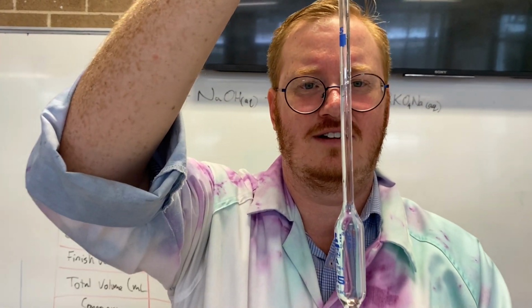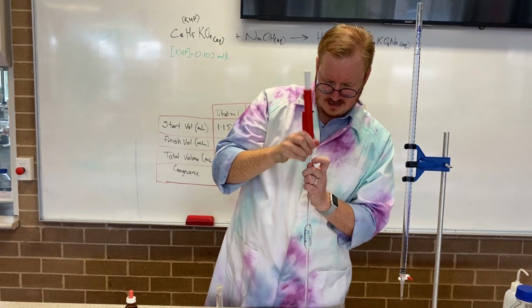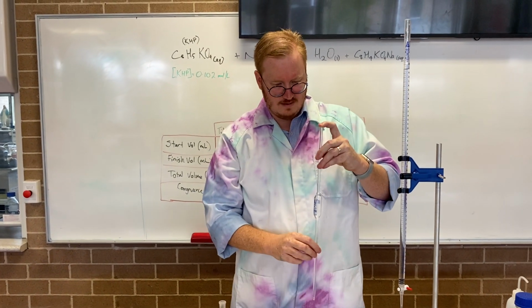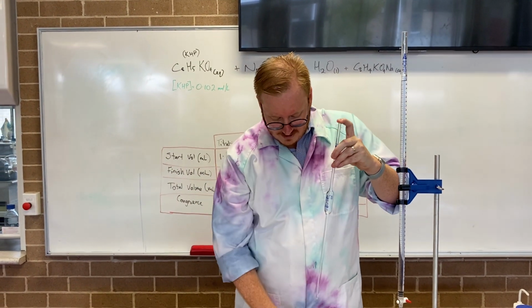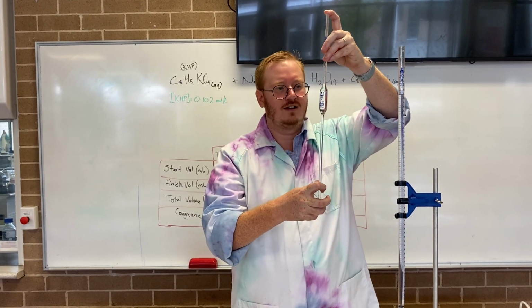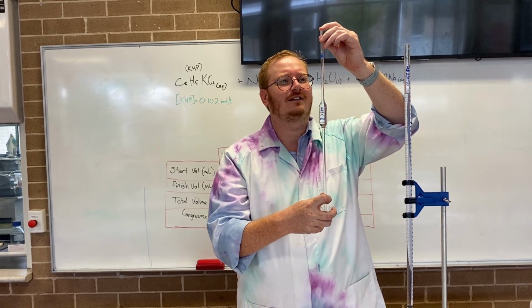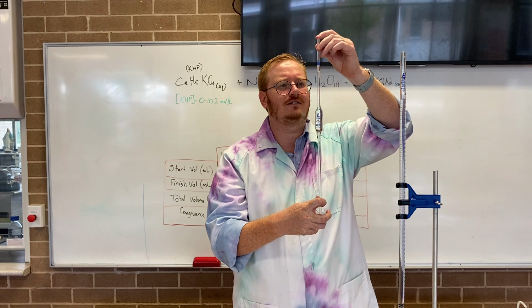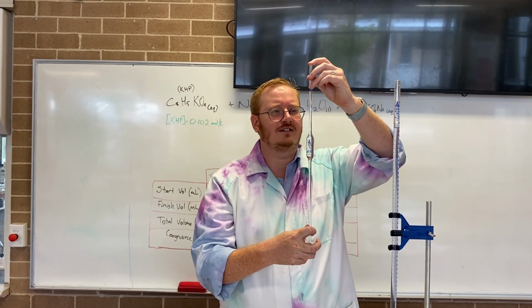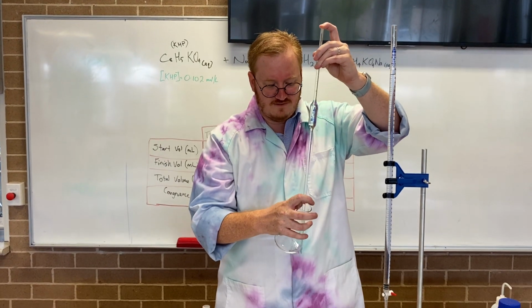Okay, there it's pretty close. But do you notice it's losing a bit of pressure? I can't guarantee that when I pull it out and deliver it that it's going to be there. So what I need to do is pull it above and change to my finger. My finger holds the pressure. And then what I'm going to do, lift the beaker, make sure there's glass to glass contact with the beaker and let it drain back by rolling my finger slightly until I hit the calibration line. It's a much better seal, much more accurate, and I can guarantee that I'm giving 25.0 ml. There we go. Deliver it to my first one.